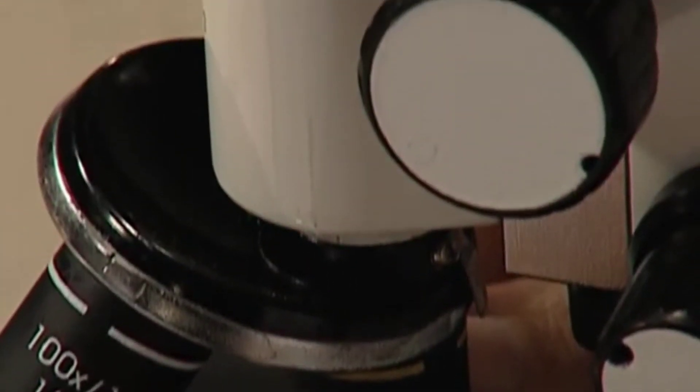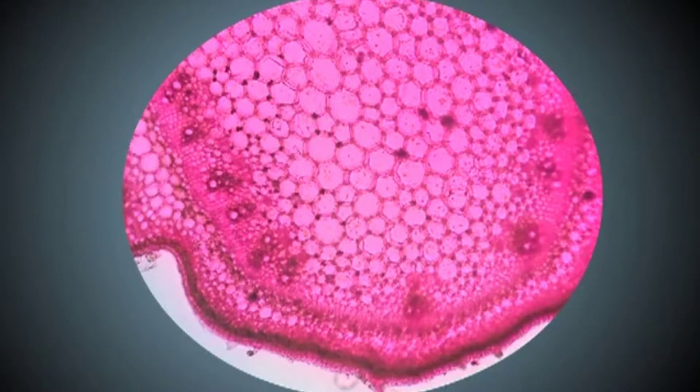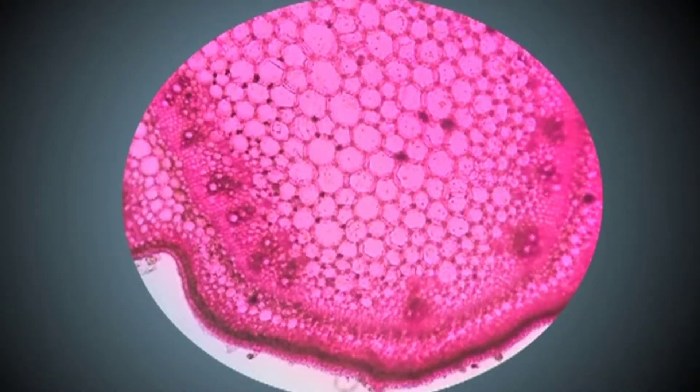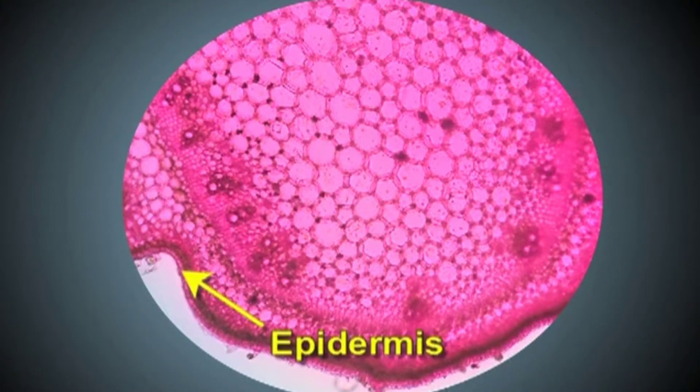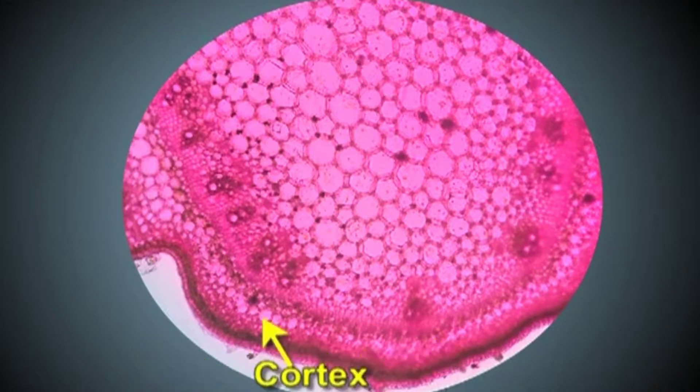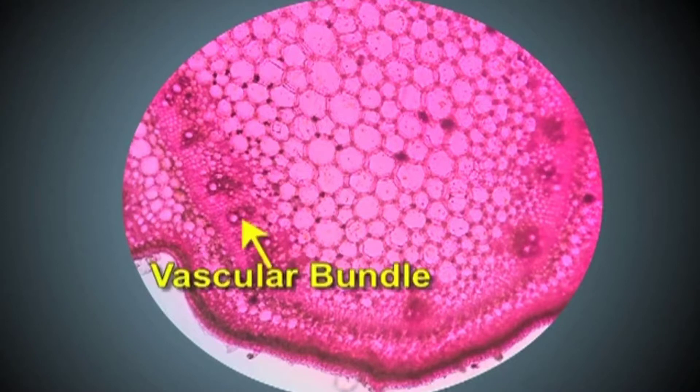Focus it under low power of the microscope and try to see the structures visible. You can find that the section is circular in outline, with a thin-walled epidermal layer. Next to the epidermis, we find the hypodermis, and next to hypodermis is the cortex, followed by a ring of vascular bundles. Internal to the ring of vascular bundles, there is a pith.